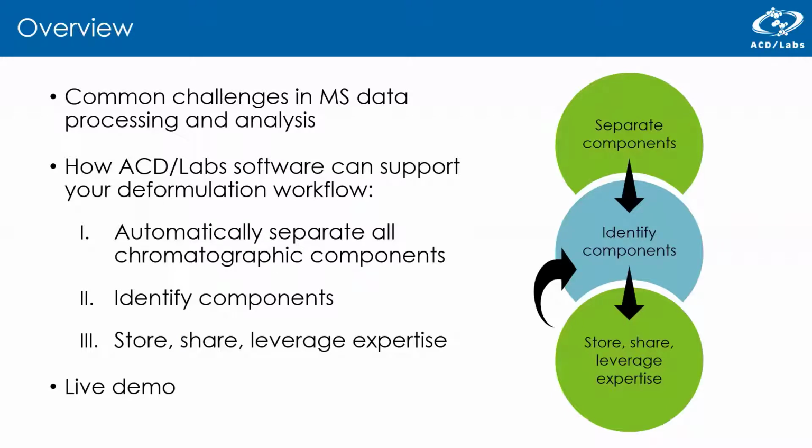Today, we are going to address some common challenges in MS data processing and analysis and show how ACDLabs software can support the deformulation workflow, specifically by addressing the following steps that are common in this workflow. So firstly, to automatically separate all chromatographic components. Secondly, to identify these components. And thirdly, methods to store and leverage this information and expertise that you as scientists may have.